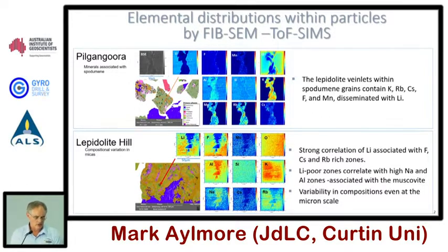And looking at increasing detail using the FIB-SEM-TOF-SIMS, because standard energy dispersive analysis techniques can't pick up light elements like lithium. We can use the combination of the TIMA data and the TOF-SIMS on the FIB-SEM, where I added the two instruments in the same room to go from one to the other. We can look at the correlations of the different light elements to the other elements.